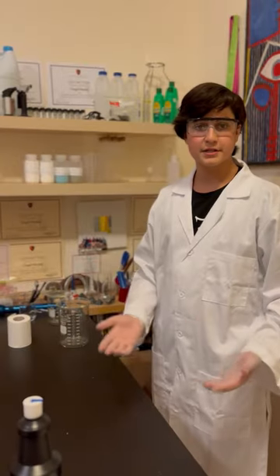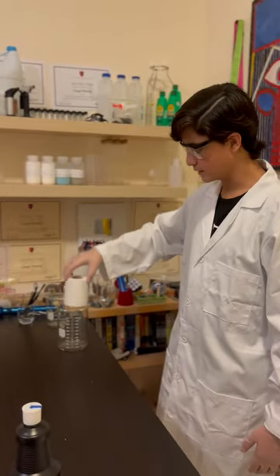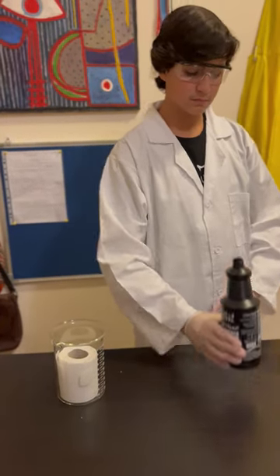Get ready. In terms of how this experiment will be carried out, essentially we'll just place this toilet roll inside of a beaker, and pour the sulfuric acid drain cleaner on top, and observe the results.